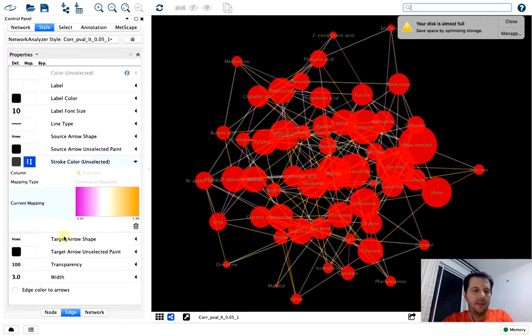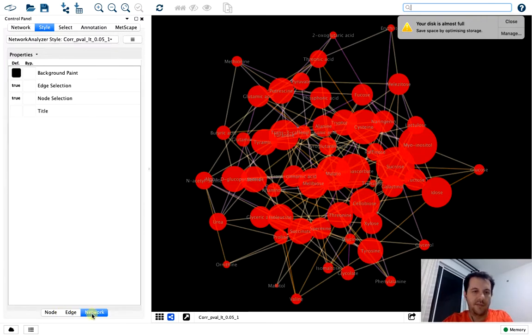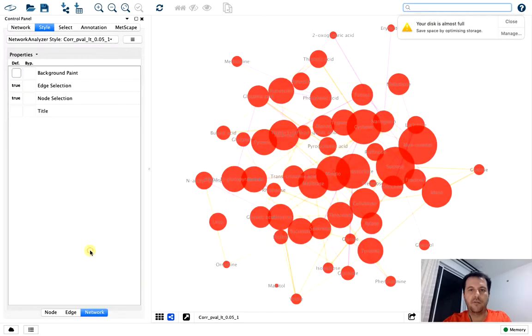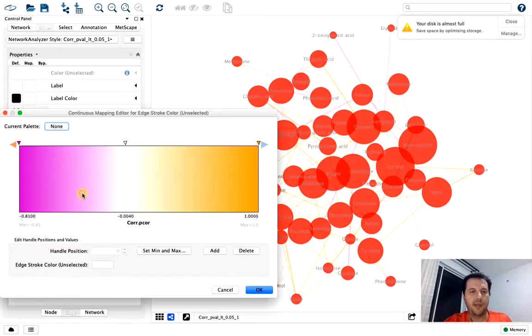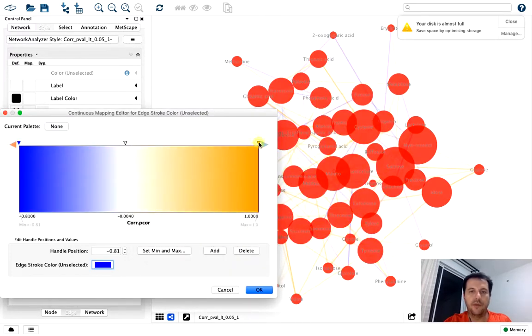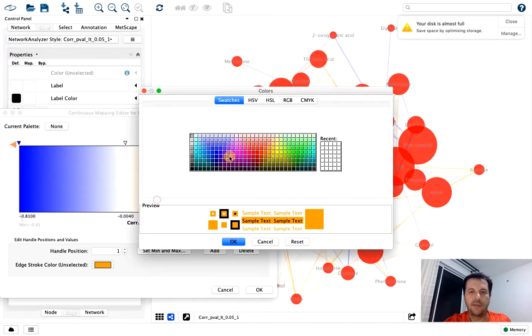I'm doing some crazy stuff here, but the best you can do is the white background, which is going to work better. Do it like a heat map. For example, here I prefer to put on blue. You can put blue here, white in the middle, and here you can have red.